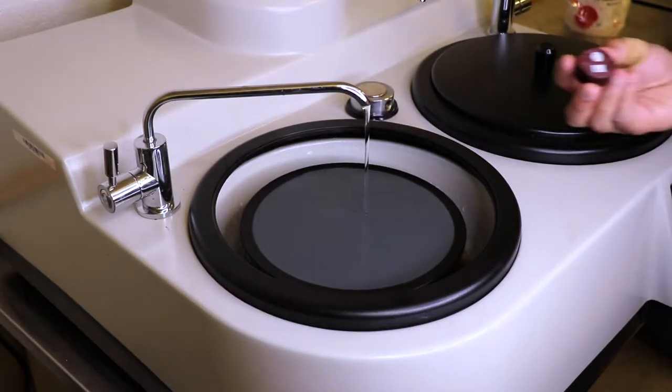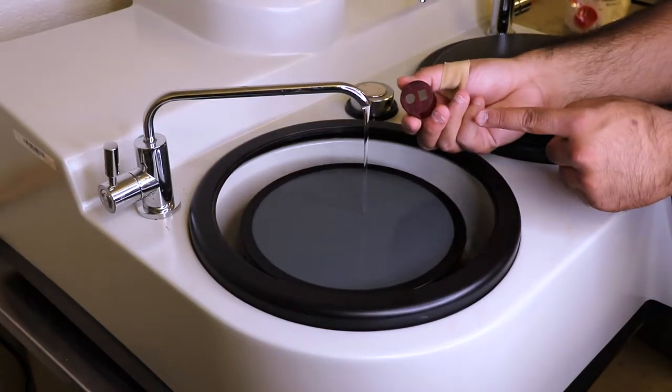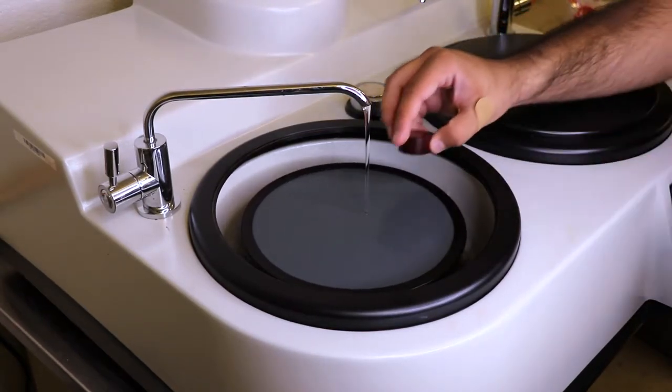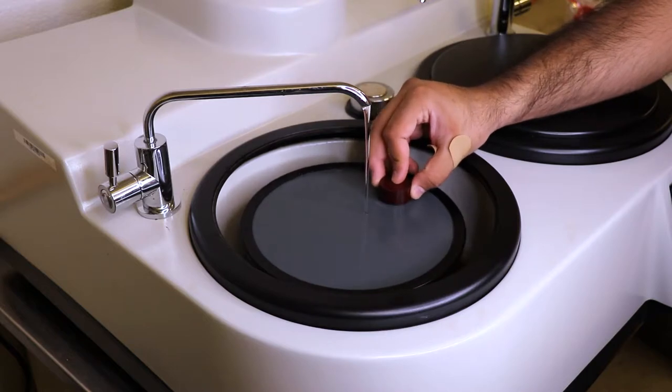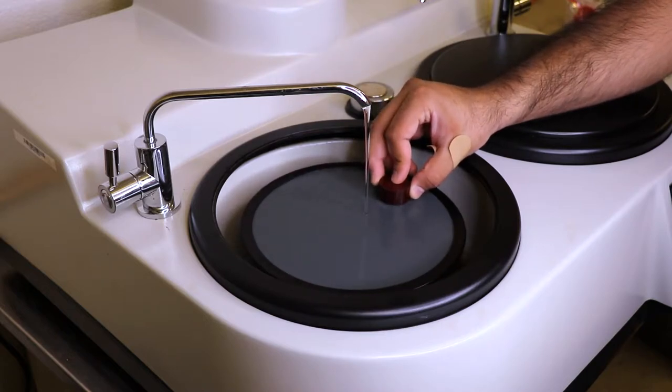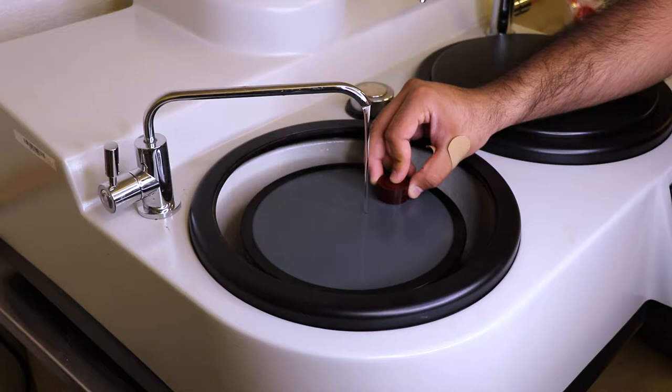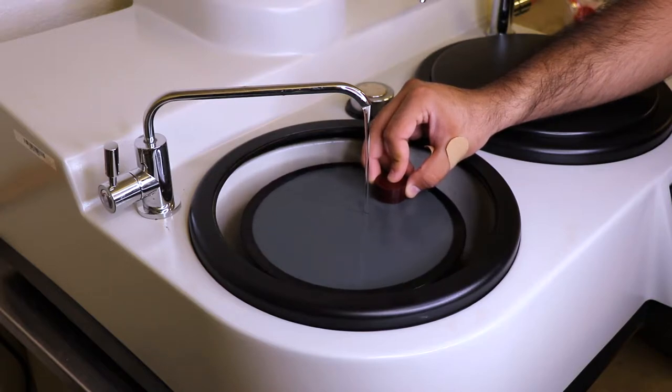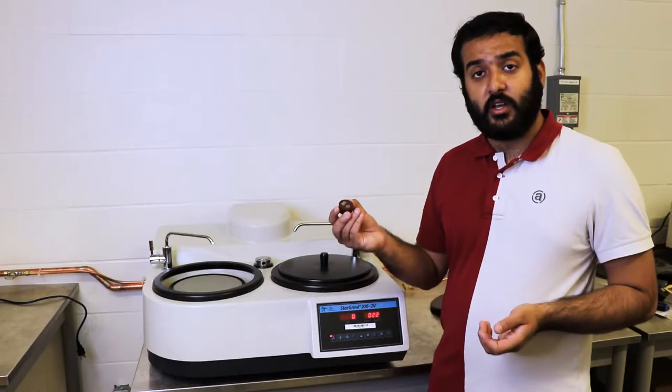You want to make a note that when you're going up the different grit of sandpaper, you want to switch the direction that you sand your sample. It should be in a crisscross pattern as you go through the different types of sandpaper. This is to prevent deep gouges and any imperfections in your actual sample itself.